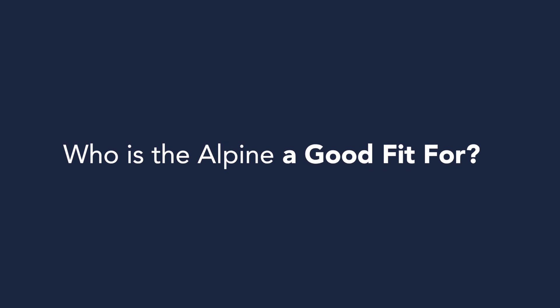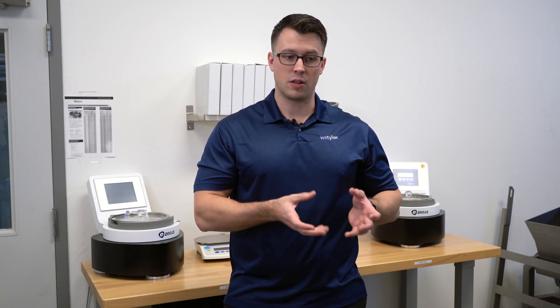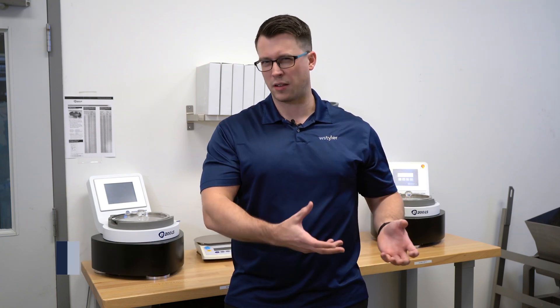Who is the Alpine a good fit for? The Alpine E200LS is a specialty sieve, which means the primary users are those for whom it's written into their standards, or those who have an agglomerating particle that won't break apart properly through the use of a regular sieve.